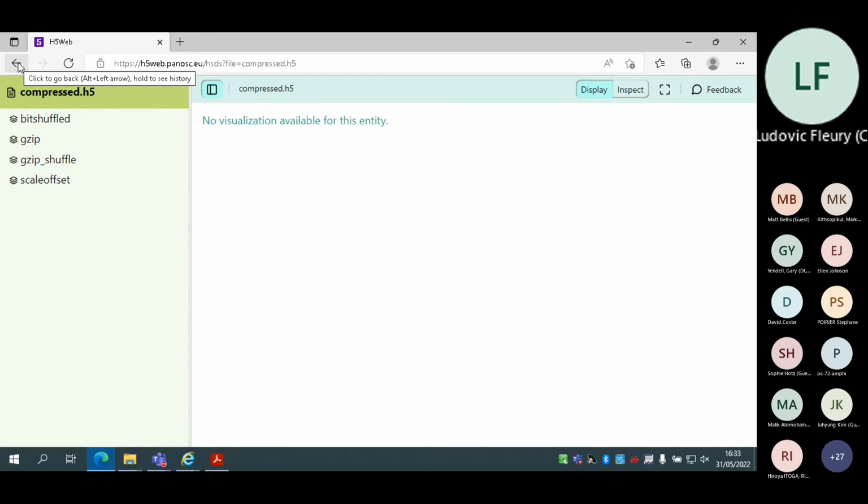And so far, the need for another ontology didn't arise from user feedback because we had only feedback from ESRF staff, and ESRF staff are quite happy with the Nexus standard. We also have feedback from other institutes as well, but this was always based on the Nexus standard.